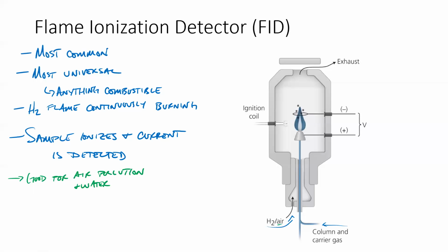Water is already fully oxidized, and so it doesn't combust in a hydrogen flame. So it's good for pollution studies. It's also very good for hydrocarbons, right? Again, things that burn well. Carbon goes to CO2 very easily, right?